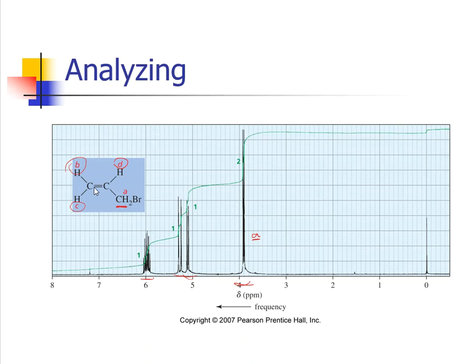All right, so a couple of tricky things are happening here. First off, we've got this bromine on a carbon, and it looks like that one is going to be the furthest away from electronegativity, right? And why aren't these other two hydrogens over here to the left furthest away from electronegativity? Why wouldn't those be A's? The reason is because they are directly connected to a carbon that has a double bond. I mean, that truly is a negative source right there. We're not talking about electron greedy. We're talking about electrons that are there.